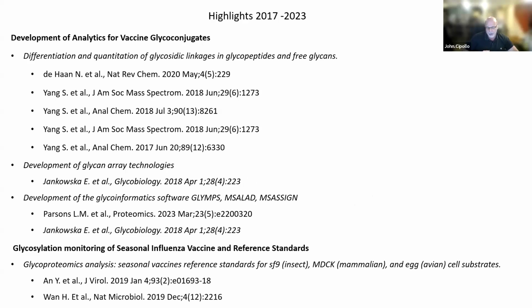M-Salad, which was a visualization program to help us with our array work, and then MS Assign, which is really a MALDI-TOF-based bioinformatics program.